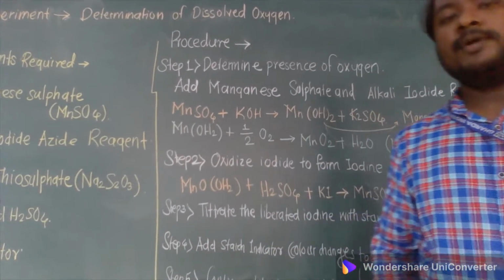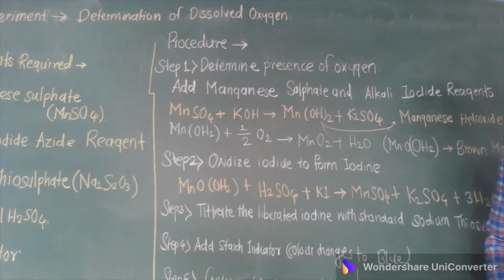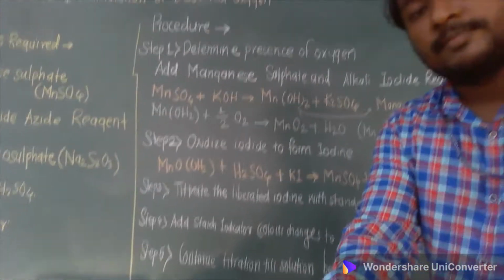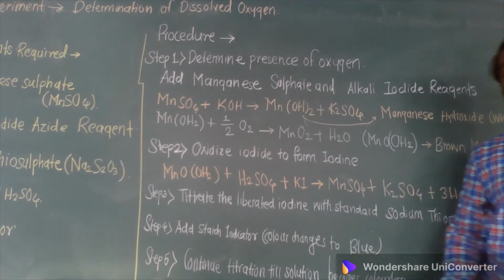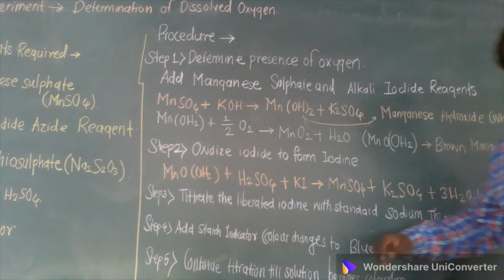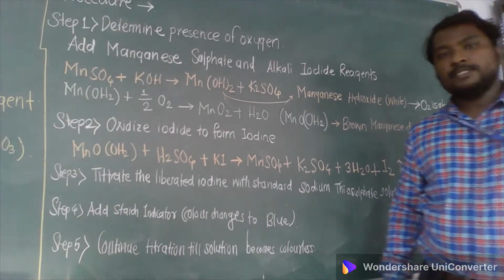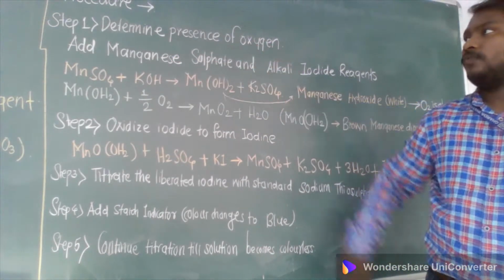Now we will see particularly the procedure which is required for this test. I have written here the procedure. I hope that all of you can see this procedure. Step number 1 is determine the presence of oxygen.